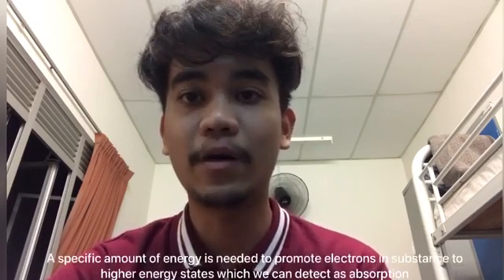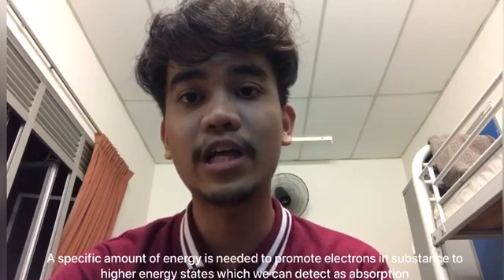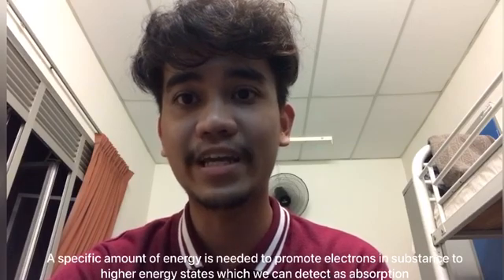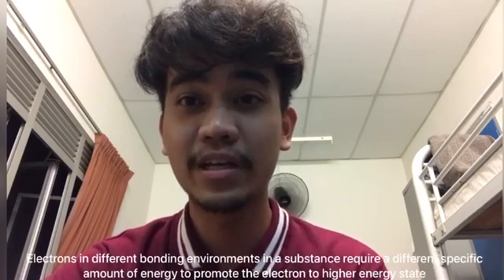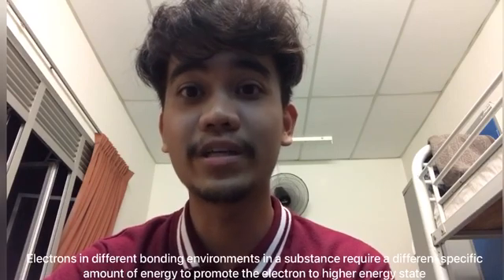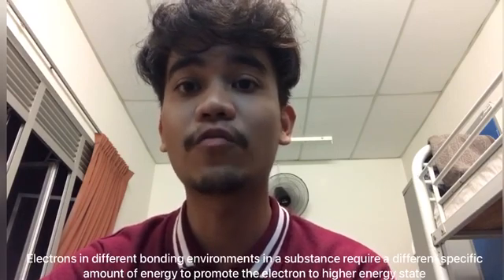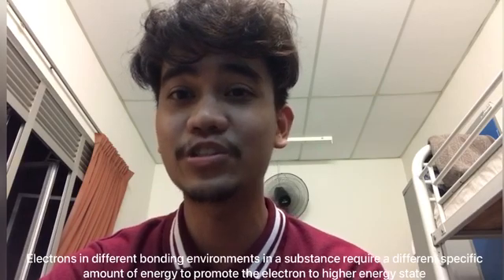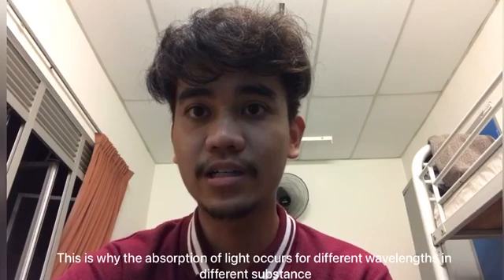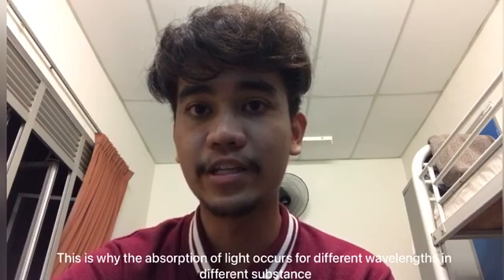A specific amount of energy is needed to promote an electron in a substance to a higher energy state, which we can detect as absorption. Electrons in different bonding environments in a substance require a different specific amount of energy to promote the electron to a higher energy state. This is why the absorption of light occurs at different wavelengths in different substances.